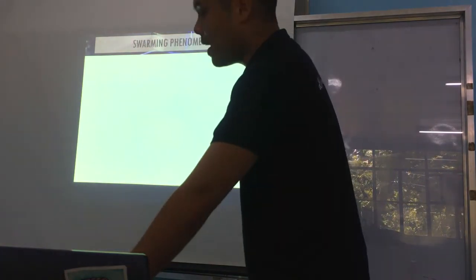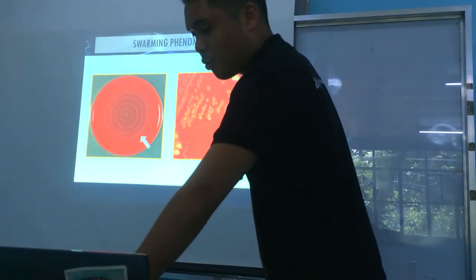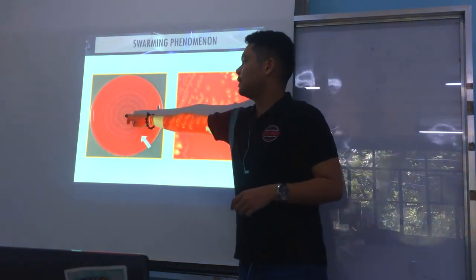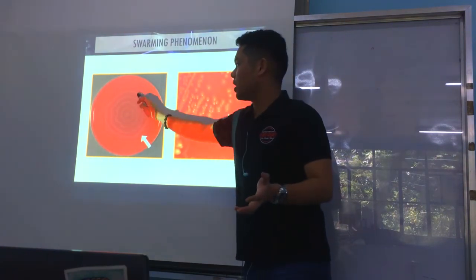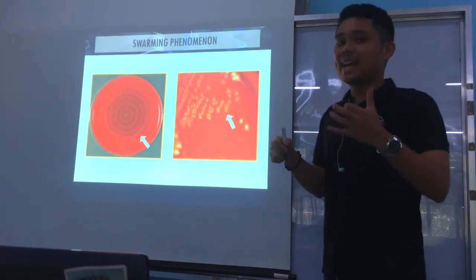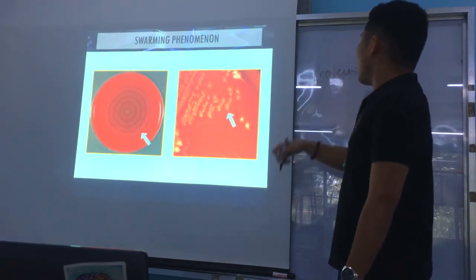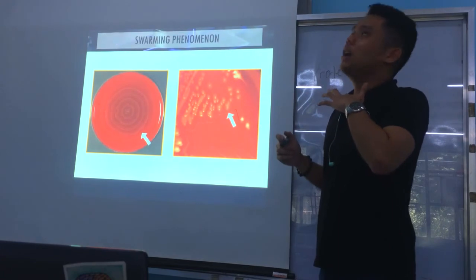Next, we go on to swarming. I mentioned swarming, yes. So this is swarming, guys, because this is due to hypermotility, okay? Hypermotility of your organism. So as you can see, didn't yung inoculate na colony, and then i-swarm na siya. Because again, hypermotil. And a very good example of an organism that exhibits swarming is proteus.